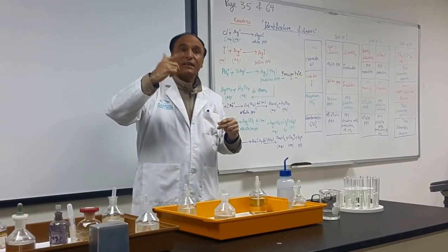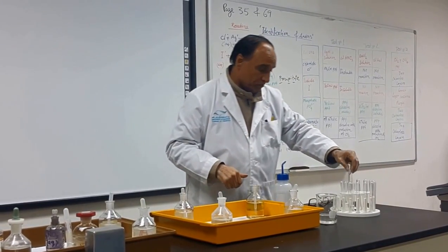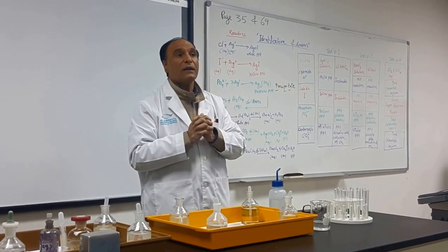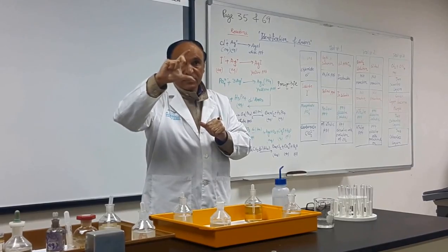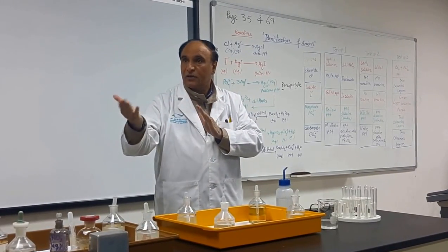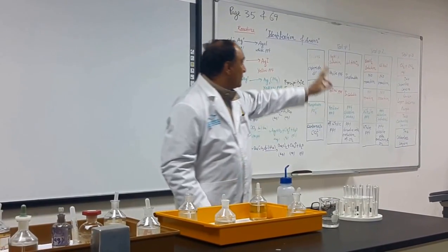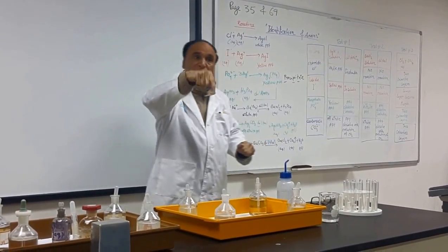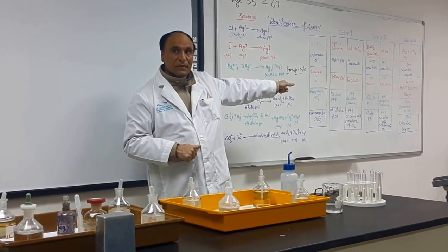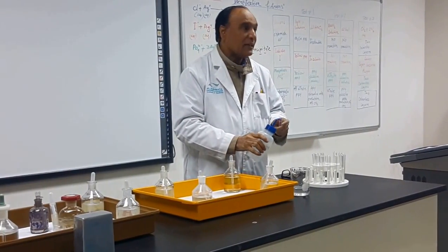Yes. Those tests which are different are more important, because, for example, next time I will give you an unknown in the test tubes, and I will not tell you what this is. I will not tell you this is chloride, this is carbonate, or what. You will do 3 tests, and you will find out what is there from the result. Right?